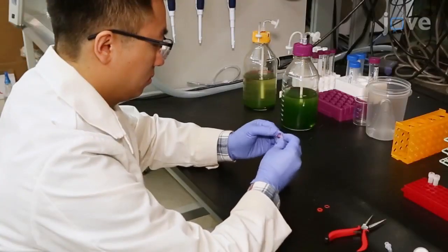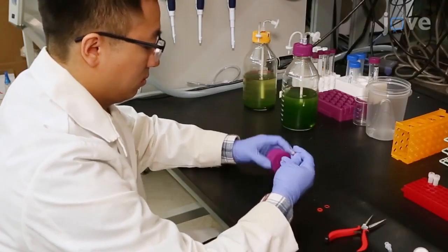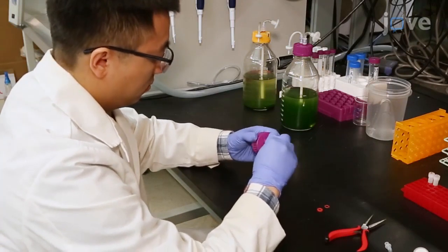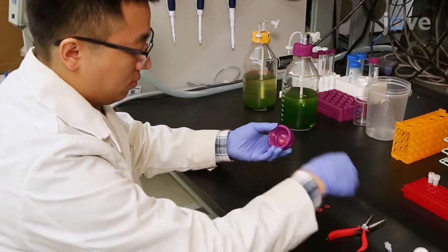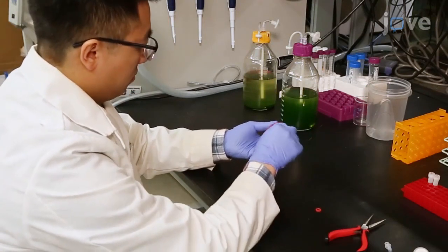To begin setup of the bubble column photobioreactors, construct a set of vented lids from the plastic lids of the 1.0-liter glass bottles and hybridization tubes as described in the text protocol.